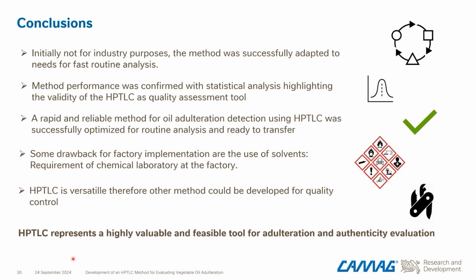And then the HPTLC is also a versatile device. So therefore, other methods could be developed for quality control. So really, to the end, that makes HPTLC a highly valuable and feasible tool for adulteration and authenticity evaluation.